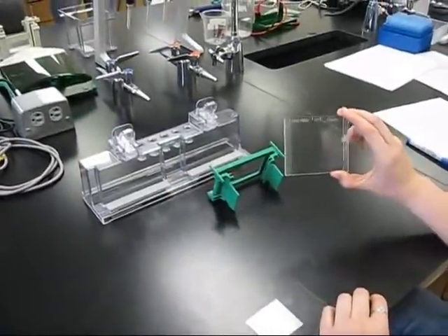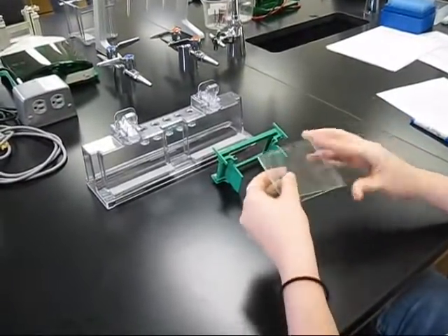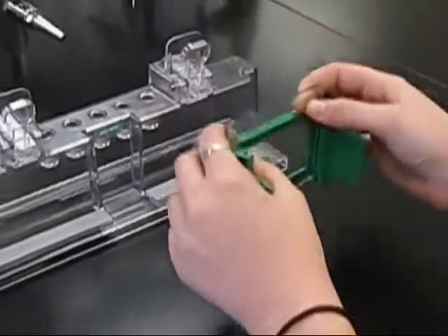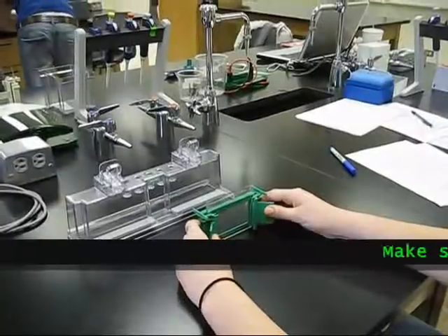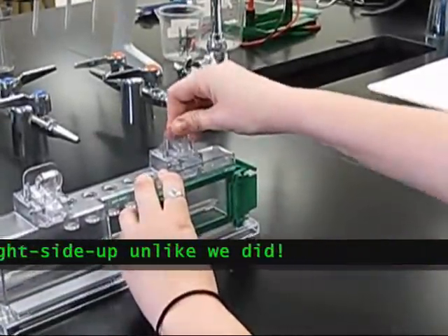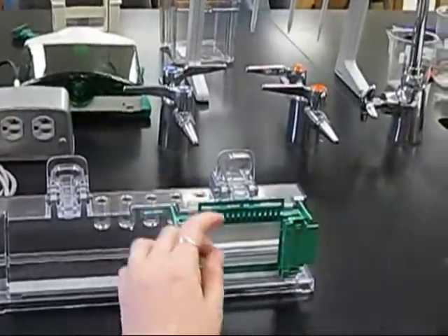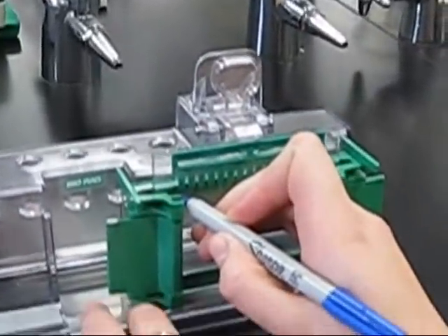Select a clean, dry spacer plate and a short plate and slide them into the cavity with the short plate facing the front of the frame. Place the entire assembly on your bench top and ensure both plates are aligned and touching the flat level surface. Close clamps and secure the casting frame assembly onto the casting pan. Place a comb completely into the assembled cassette. With a blue marker, mark the glass plate one centimeter below the bottom of the comb teeth.